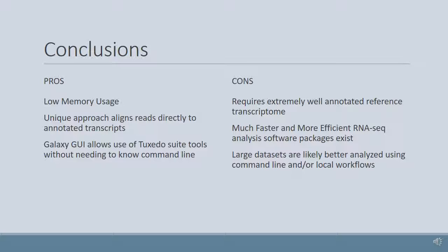But overall, the Tuxedo Suite is a really good package. It provides all the insights that you need. All the documentation out there on the internet makes it very easy to use and to troubleshoot if you were ever to run your own RNA-seq analysis.